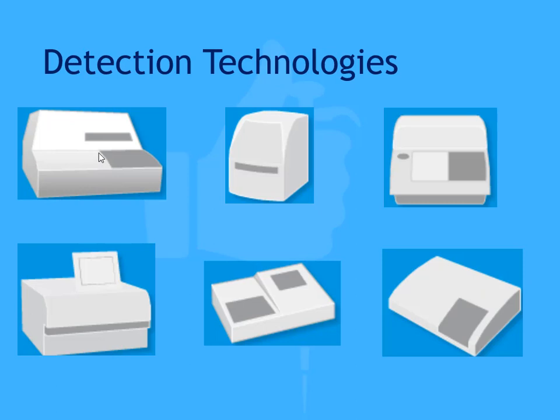Luminometers are specialized plate readers that are used for luminescence immunoassays, or LIAs. Luminometers measure RLUs, or relative light units. Similar to ELISAs, in LIAs, the RLUs correlate to the amount of analyte present. LIA microplates have the same layout as EIA plates, but they differ in that ELISA plates are clear while LIA plates are opaque. Radioimmunoassay, or RIA, is another methodology used to measure assays. A radioactive isotope like iodine-125 is used to generate counts per minute, or CPMs.